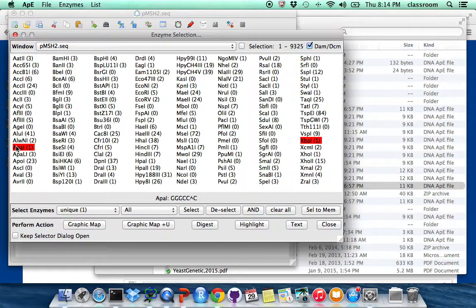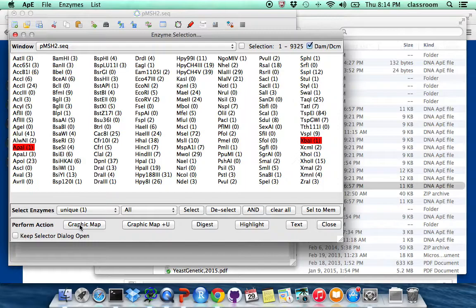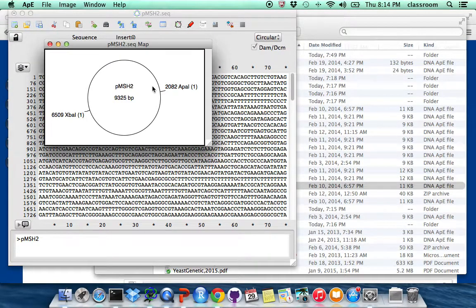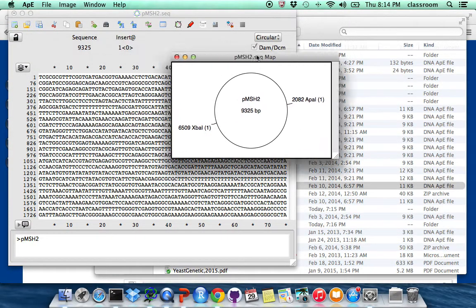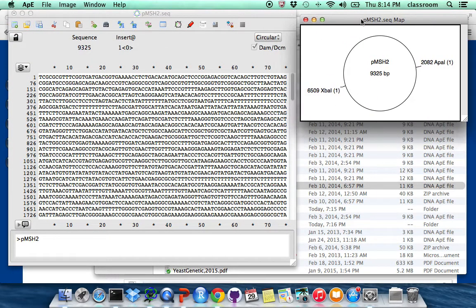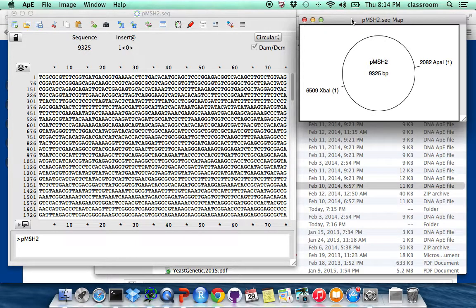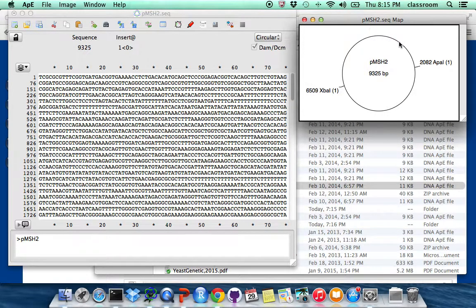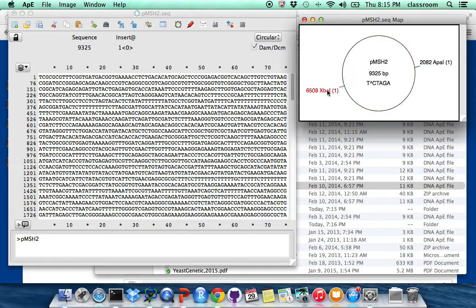Okay, so I'm going to now click the graphic map there. So that's our graphic map of plasmid PMSH2 with APA1 cut and XBA1 cut.